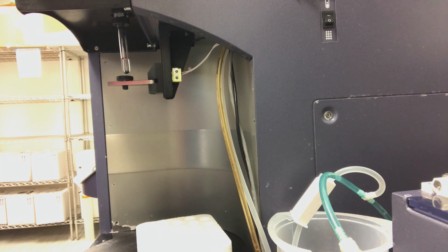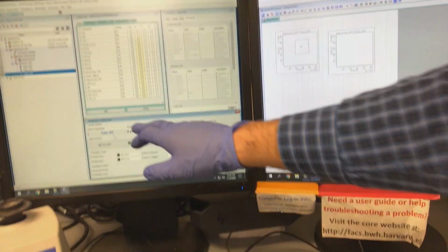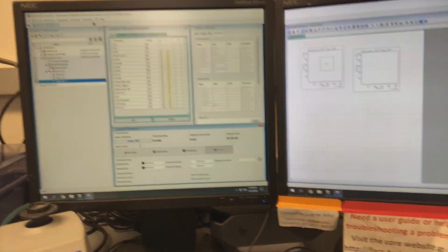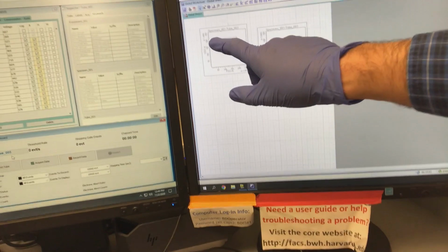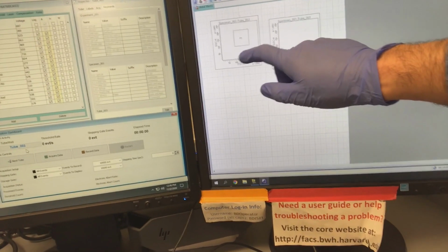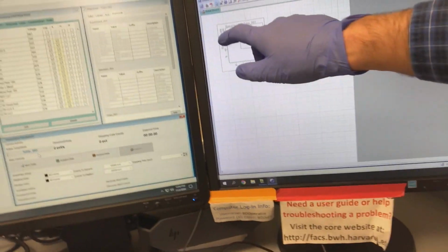If you think that there could be an air bubble in the system, you can diagnose this by still seeing potential threshold rate here of events per second of sample being run through the machine. But you've actually lost side scatter. So you'll see events stacking up along the x-axis, along the forward scatter here, but no side scatter.